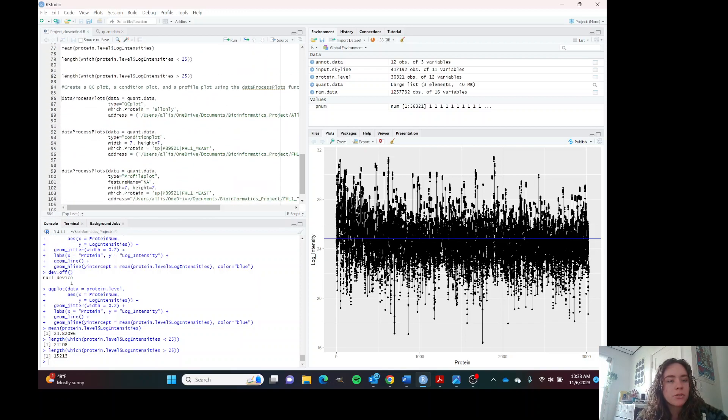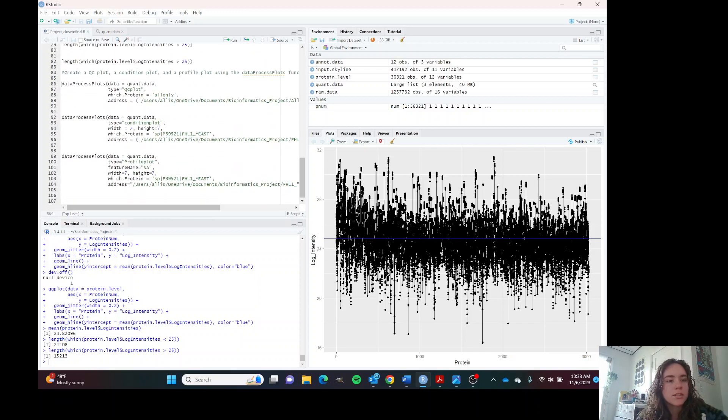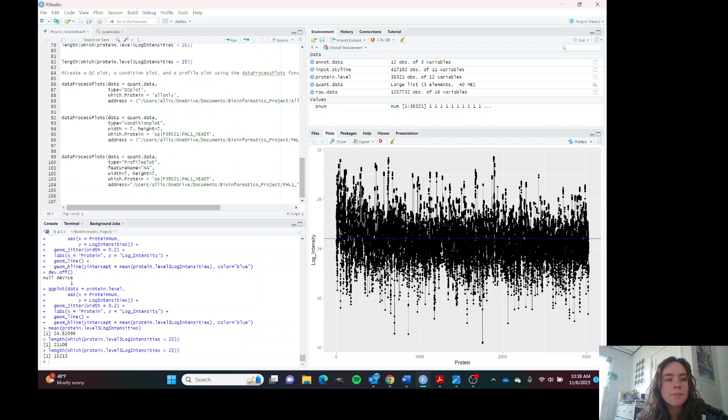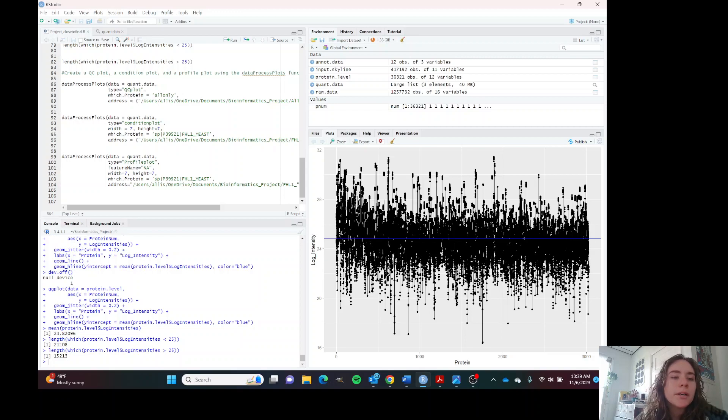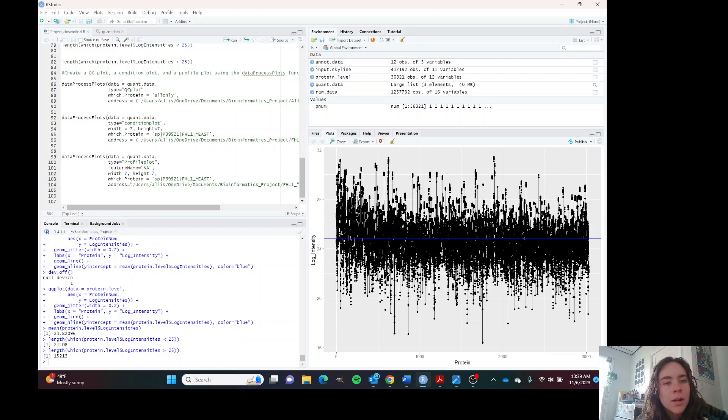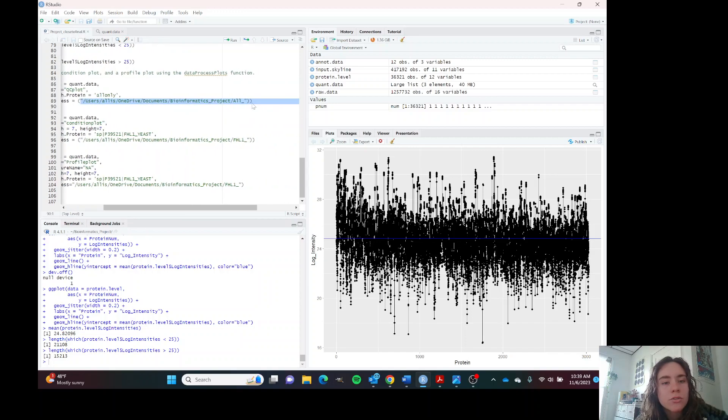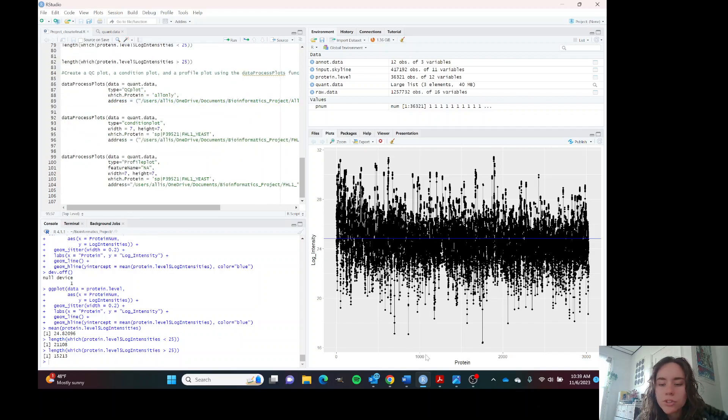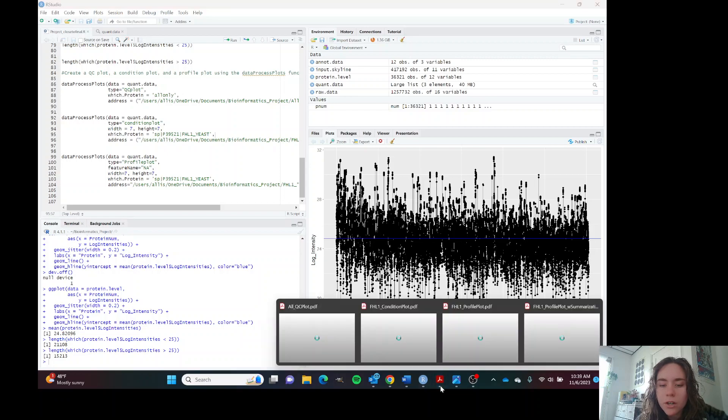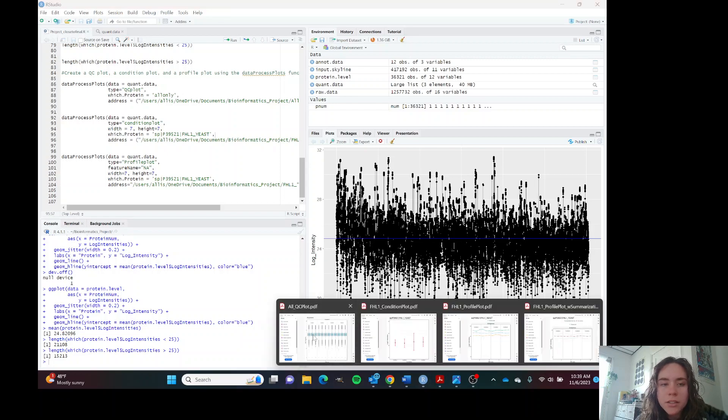Now we can create these process plots. I'm not going to go through and run them now. I'm just going to talk about them a little bit because they take a while. We're going to create a QC plot, a condition plot and a profile plot. You can automatically output your plots by putting in the directory and this function does that. We'll just take a look at what our plots look like.